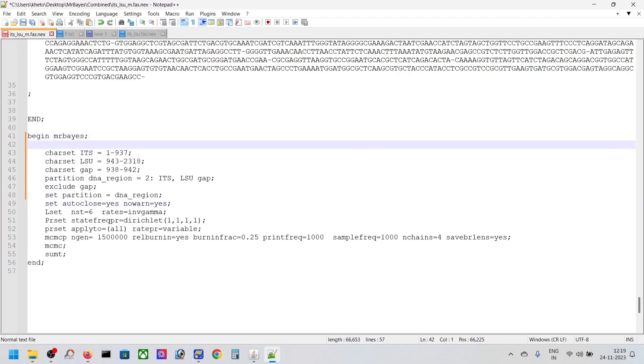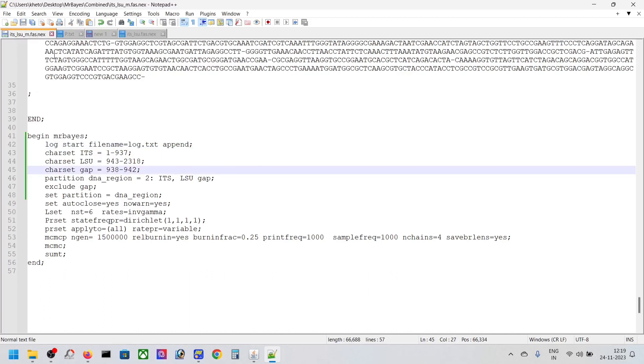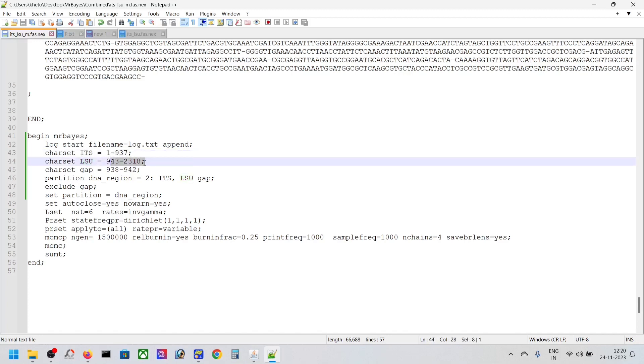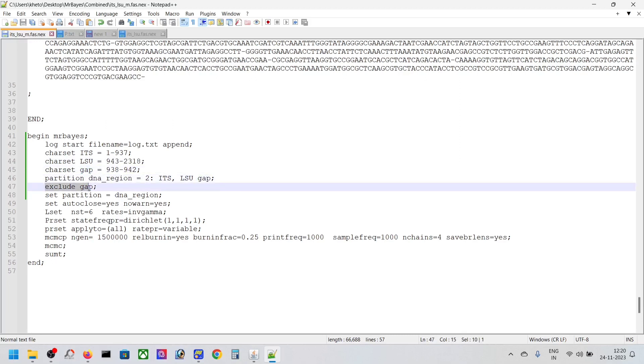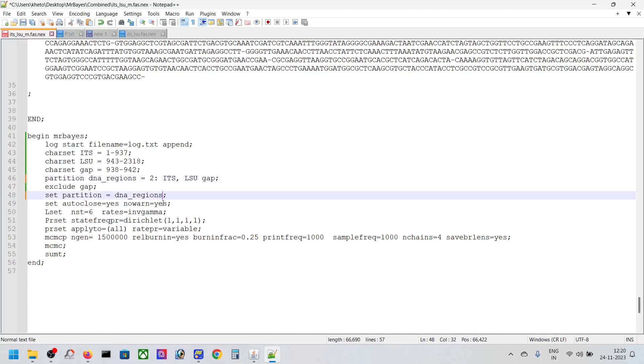If you want to create a log, just put log file characters. This will start the log with the name log.txt. This is your Nexus file, and we'll include it in the analysis. Save it. You can see we have our character set from here to here for ITS and LSU, then GAP. We're excluding GAP and we have partition DNA region with two partitions.